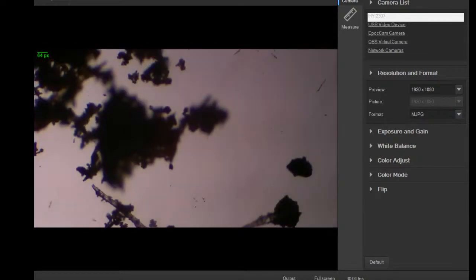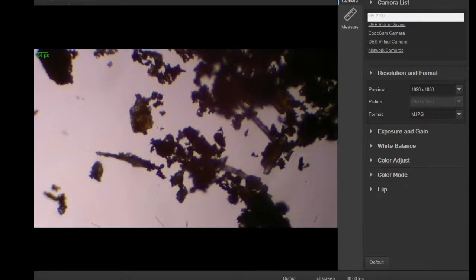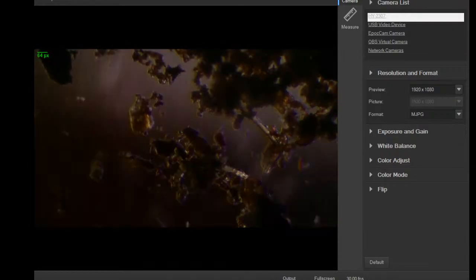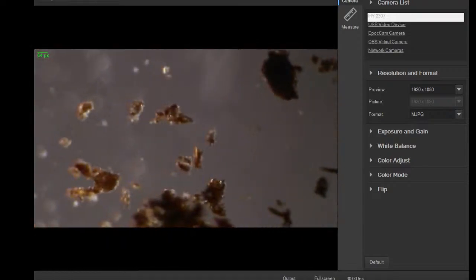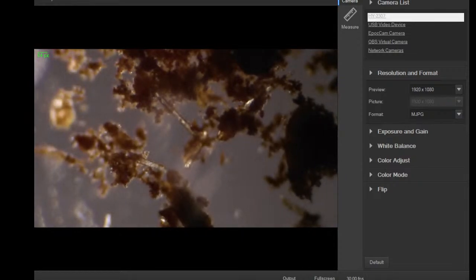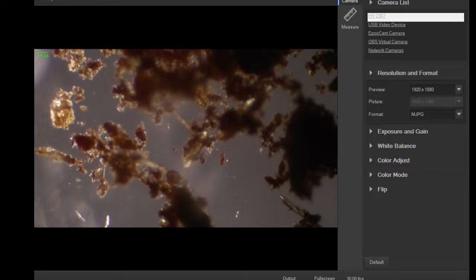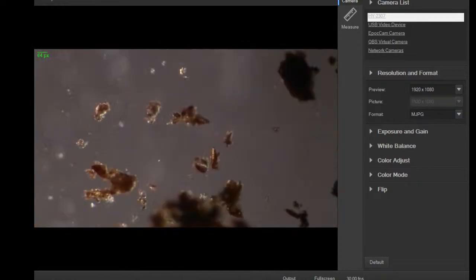Look at that. Change the light levels here. One more color through here. There we go. Look at that. That's nice. So it looks like a fine powder is pretty odd, chunky bits. Definitely can see the crystals of the cinnamon flavoring bits in there.